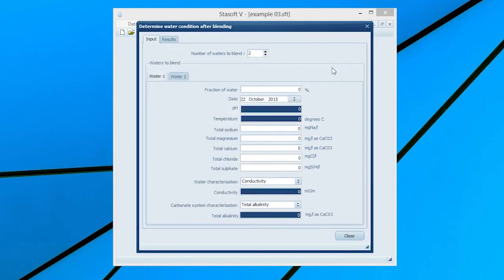Enter the number of waters to blend — in this case 2 — into the input box, and then complete the relevant data for the waters as provided in Example 5 in the manual.